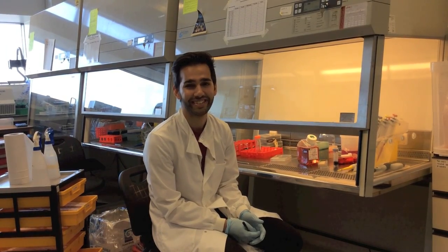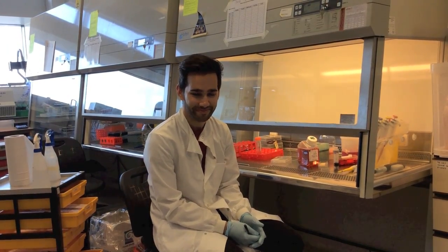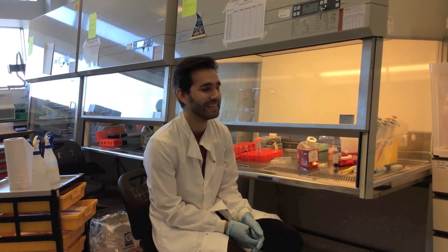Brilliant. So what's infected is going to be green, and the non-infected are going to be dark. And you have to count numbers of infected cells. Oh, that's fun. So why are you doing this? I'm doing this to hopefully develop a means of testing new medications that are used to treat viral hepatitis. Hopefully we can pass this on to drug companies to help them test out all the different drugs they come up with and hope that one of them will be more specific to patients. This looks really interesting, generating antivirals coming through. Thank you very much.